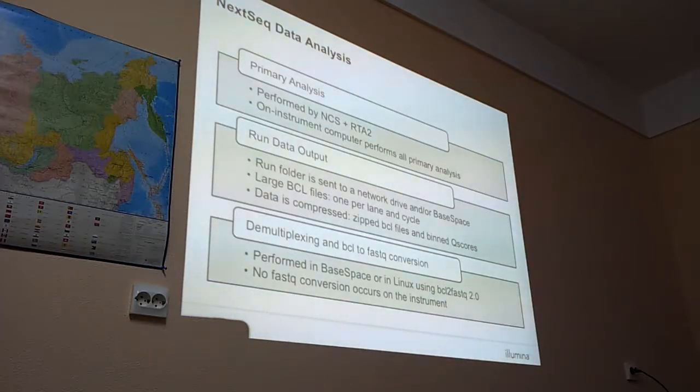So really use it. There you have all the different applications, and it's completely free to use, and it's easy. You don't need Linux or something like this. But Sensibilio gives us better results.